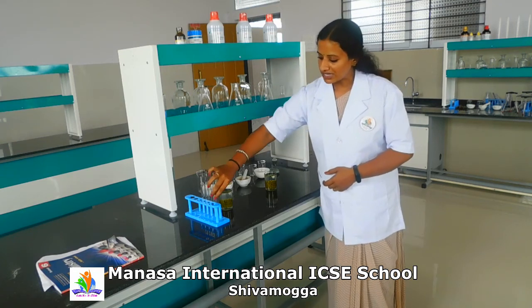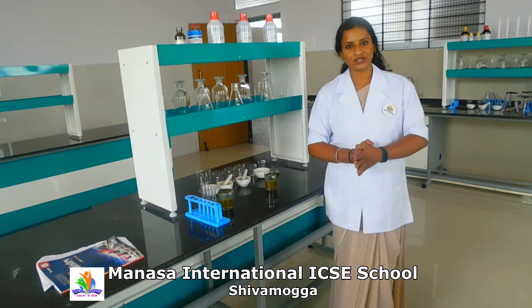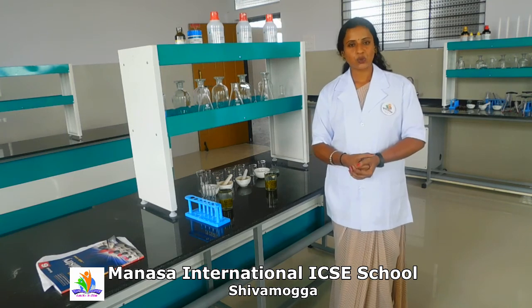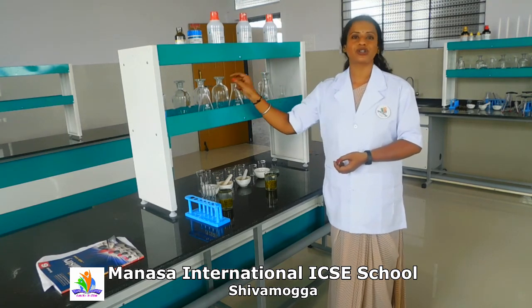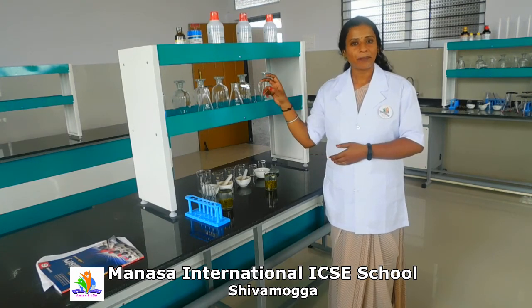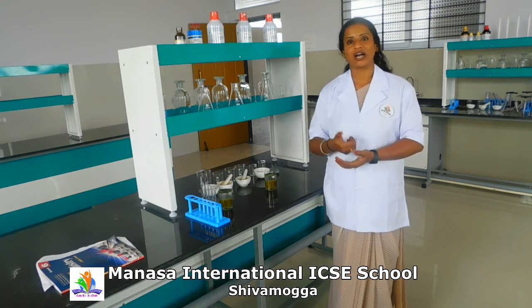So dear students, this is an introductory class for this chapter, common laboratory apparatus and equipments. In the next classes we will come to know how to handle each and every apparatus of the chemical laboratory, the different apparatus details, what the names are and how to handle them.